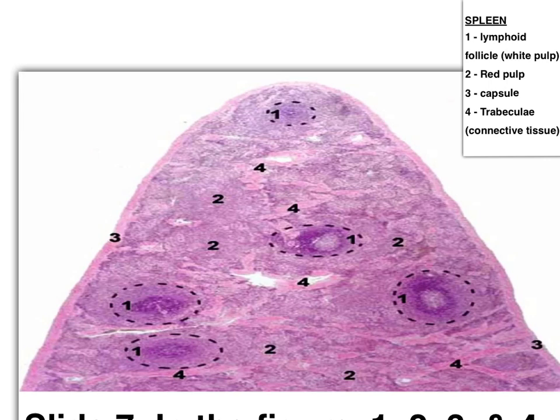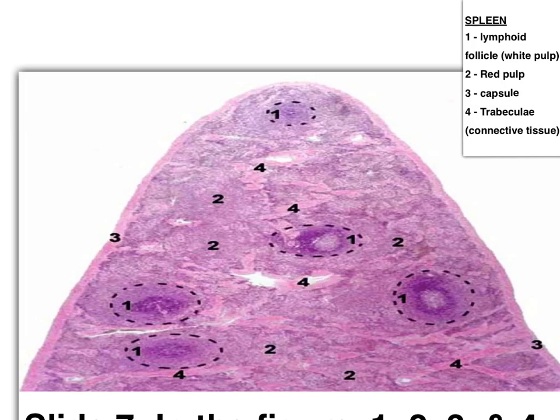This section is for the spleen because it has scattered follicles. If you look at the follicles you can identify a follicular arteriole — so it is the spleen. Number 1 is the white pulp or the lymphoid follicle. Number 2 is the area between the follicles, which is the red pulp. Number 3 is the thick capsule. Number 4 is a trabecula — red stained connective tissue that mainly comes from the hilum.